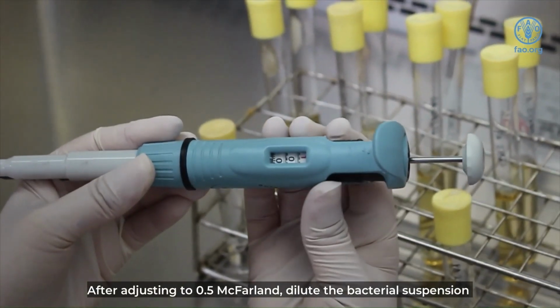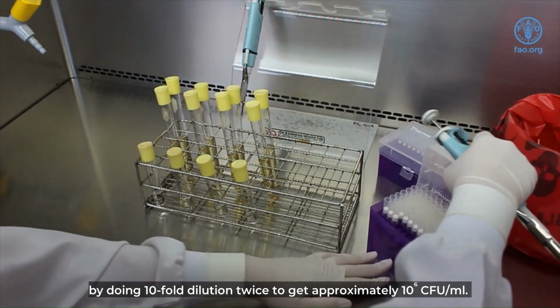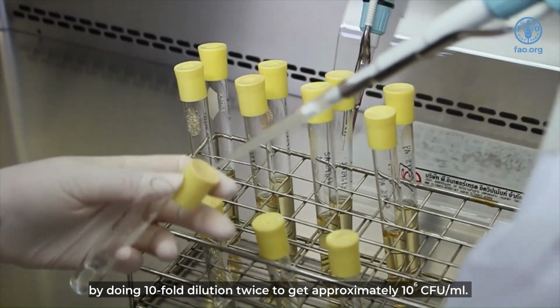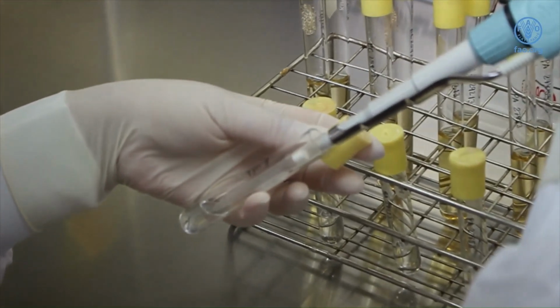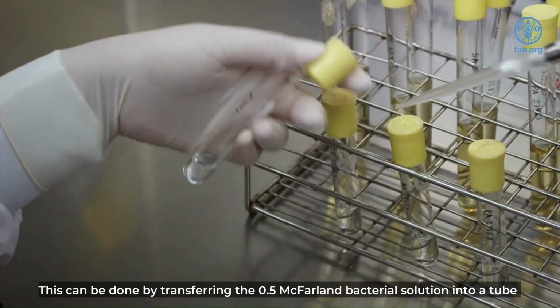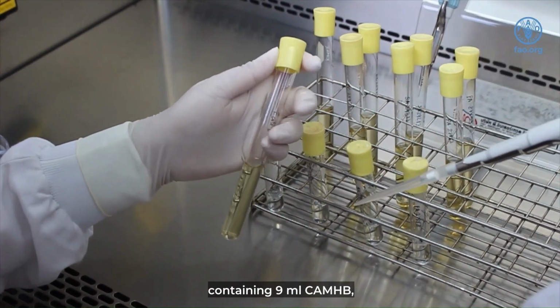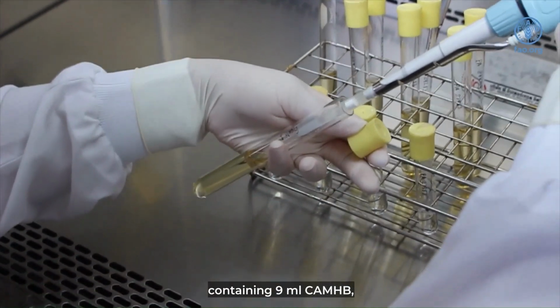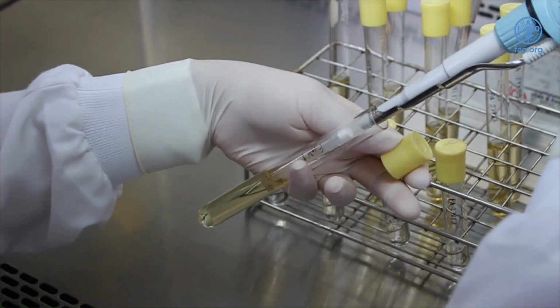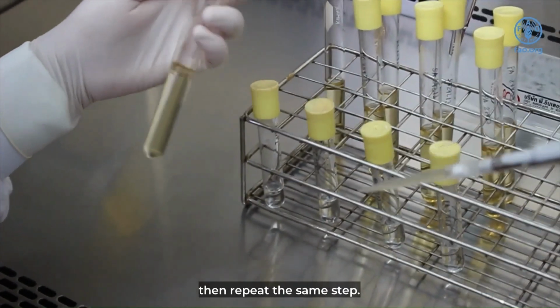After adjusting to 0.5 McFarland, dilute the bacterial suspension by doing tenfold dilution twice to get approximately 10 to the power of 6 CFU per milliliter. This can be done by transferring the 0.5 McFarland bacterial solution into a tube containing 9 ml CAMHB. Then repeat the same step.